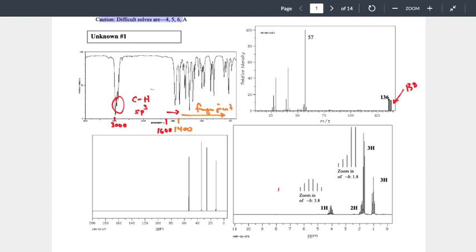Right? So what elements do you think could be in our possible formula? Carbon, hydrogen. Why do you think carbon and hydrogen should show up? Because that's all we do in here. That's a fair statement. Not quite what I was looking for, but yeah, that's fair. It's an organic chemistry class. We would expect to see some carbon and hydrogen.